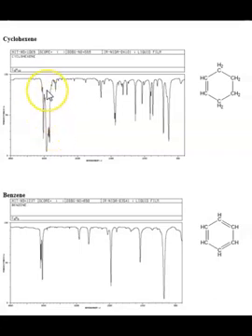Now if you remember, that is a CH stretch, just below 3000, called a CH or alkyl stretch. Lots of CH bonds there. Look at this. There are very few CH bonds here, right? And so that's why you get a real skinny version of that, because you only have 1, 2, 3, 4, 5, 6. Here, though, you have more, because you have the CH2s. And so that's what shows up here, okay?